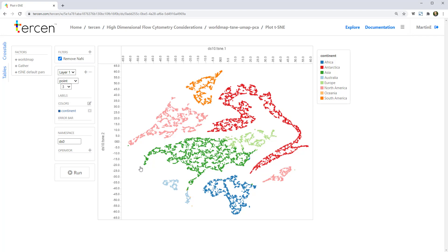The continent shape is mostly preserved, but some of the continents have changed position relative to each other. This means the global structure has not been maintained so well. See that Antarctica, in red, has changed completely in both position and shape.